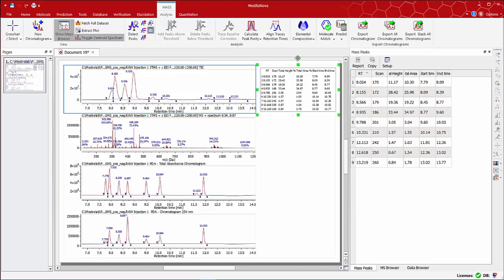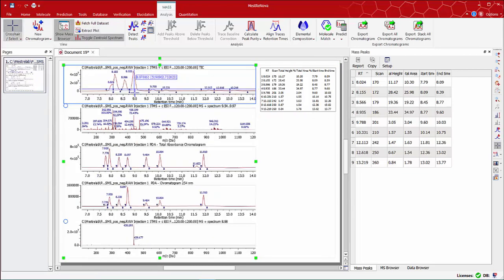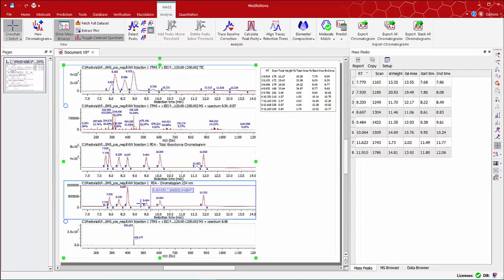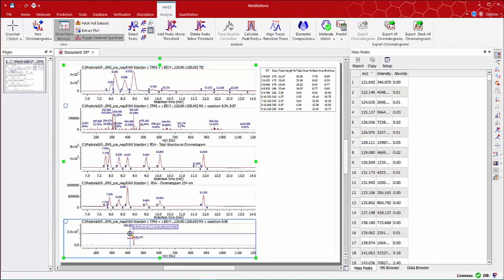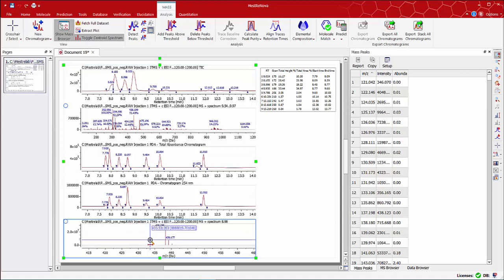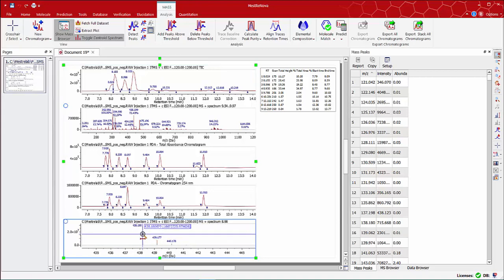There's a way to extract the ion chromatogram graphically or manually. For instance, if you select the Crosshair tool and select the mass spectrum of this peak, go to the MS trace and zoom in on the particular peak we are interested in, like this one at 438.